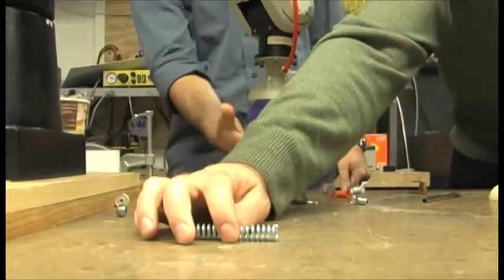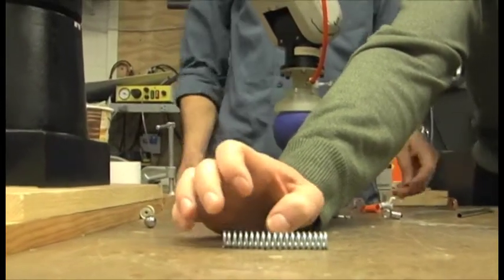And it's encased in an elastic membrane, and for this prototype we're using a latex balloon for that membrane. And so what happens then is you can control the pressure inside the balloon.